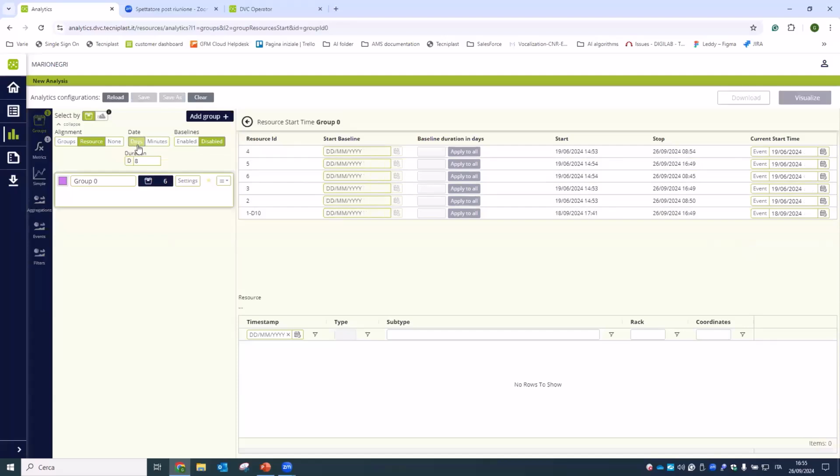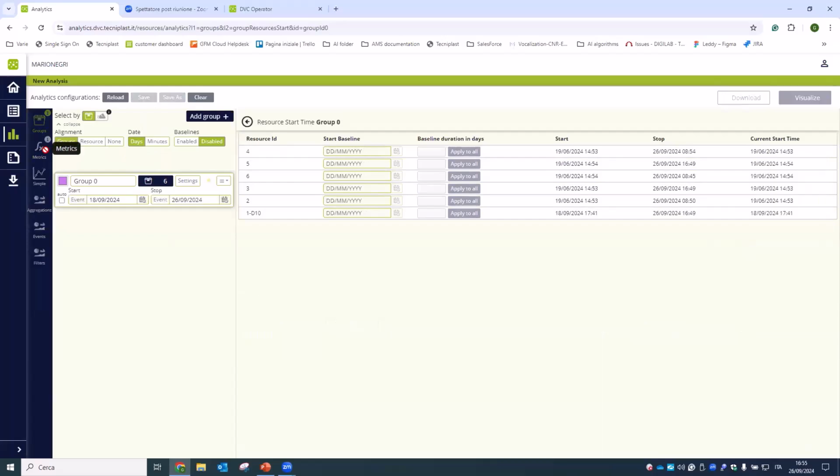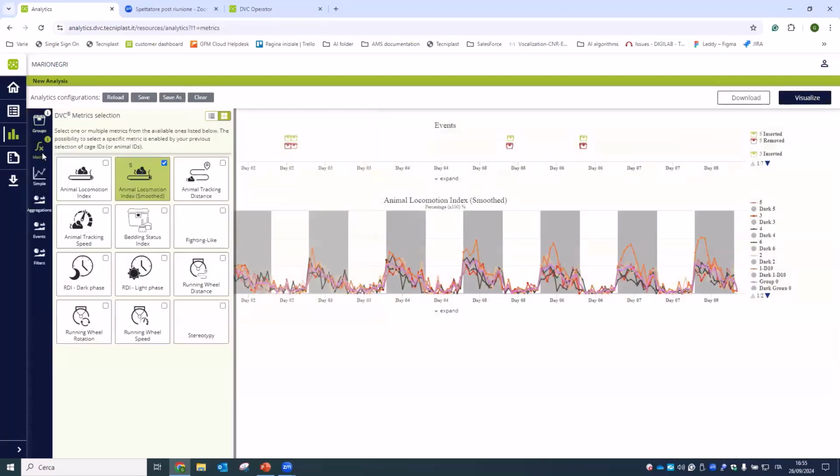Again, probably much more difficult to explain for me than to do. What else I want to... time as usual is running very fast. I want to explain to you in detail the metrics. As said, we have several metrics.